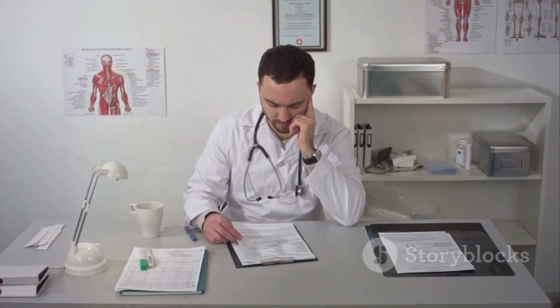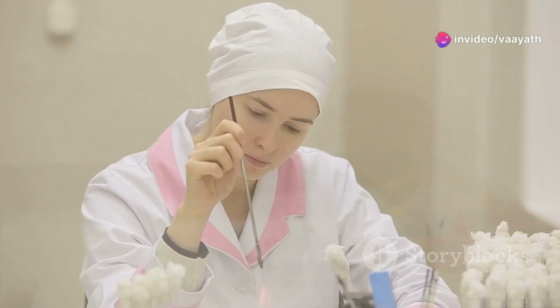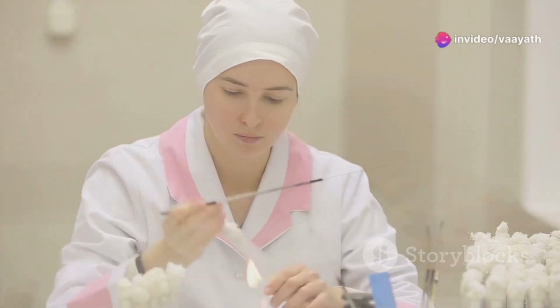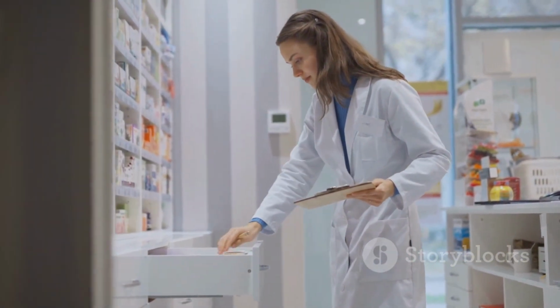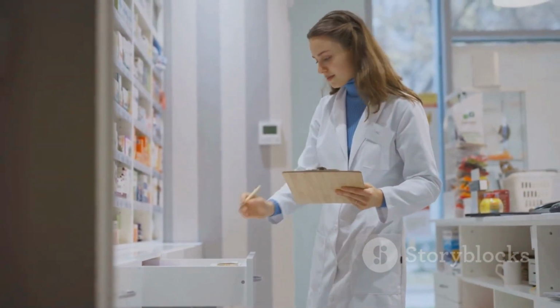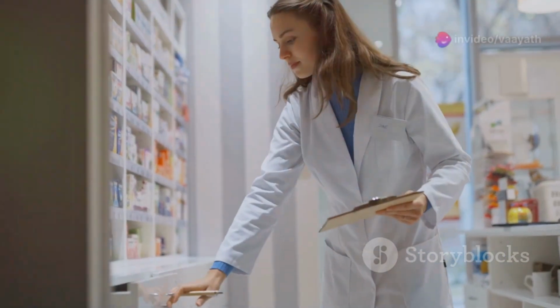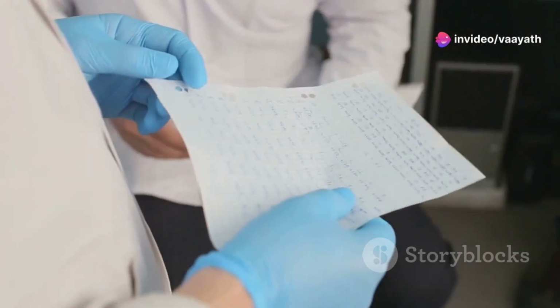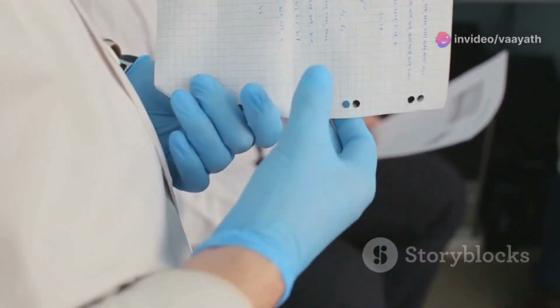Section 8. Documentation and revalidation in media fill. Documentation is paramount in media fill validation. Every step from media preparation to result interpretation is meticulously recorded. This documentation serves as an audit trail, demonstrating compliance with regulatory requirements and providing evidence of a robust sterility assurance program. In the unfortunate event of a media fill failure, thorough documentation is crucial for investigation.